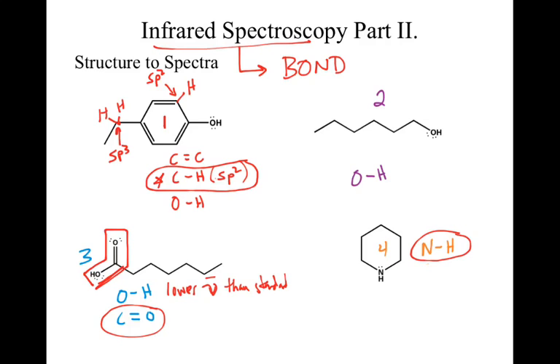Once you've identified what structure belongs to the IR, then you can go through and label the IR spectrum in more detail and account for all of the individual, or at least 2 of the individual bonds that show up within it. Okay? So take advantage of your structural understanding to identify bonds, then look up what those bonds are supposed to look like, then look at those images within your spectra. Okay?